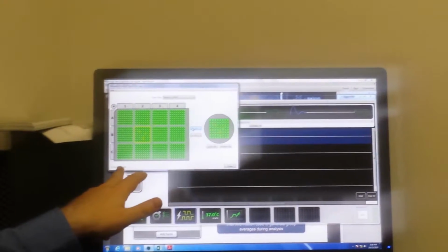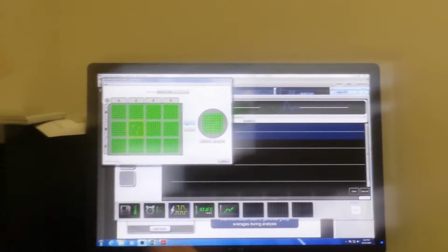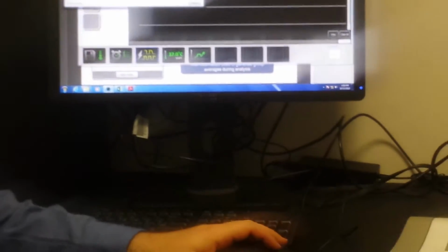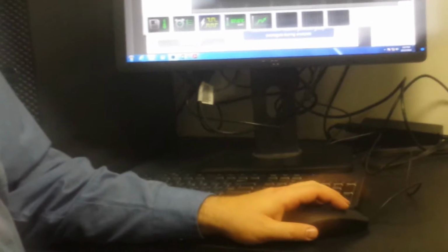Is that per well or per plate? Per plate. Yep. So 64 anywhere on the plate. And there's a yellow thing around the ones that aren't stimulating? Yeah, there's a little red box on the individual electrodes. It's hard to see from a distance.